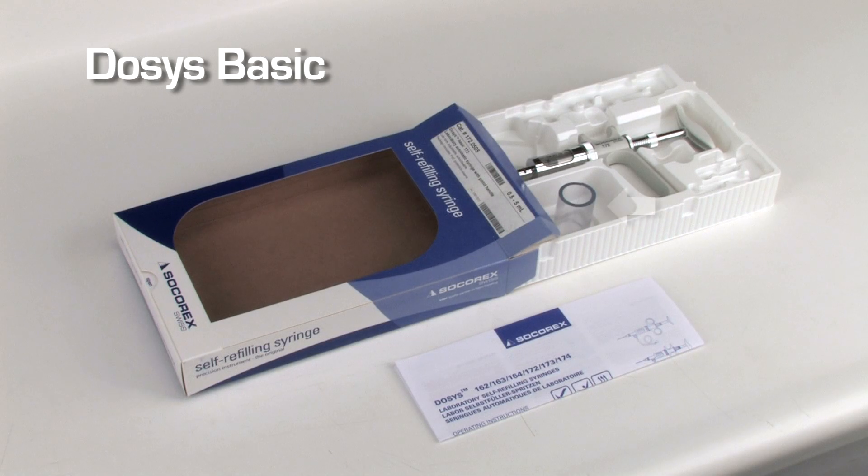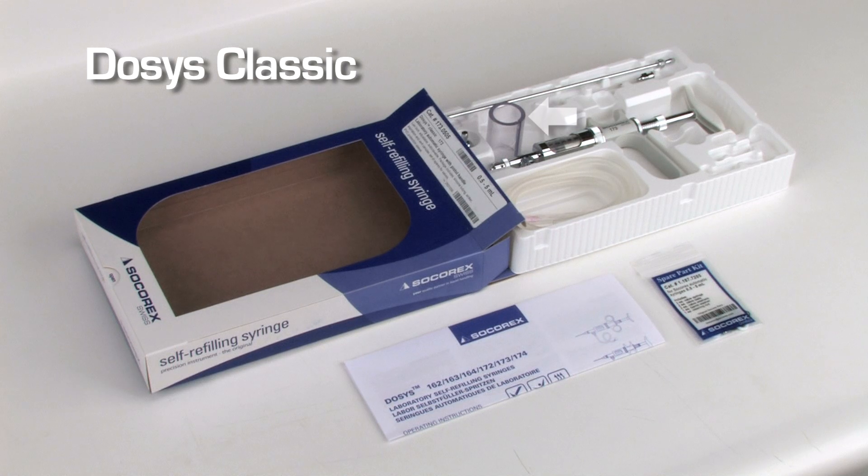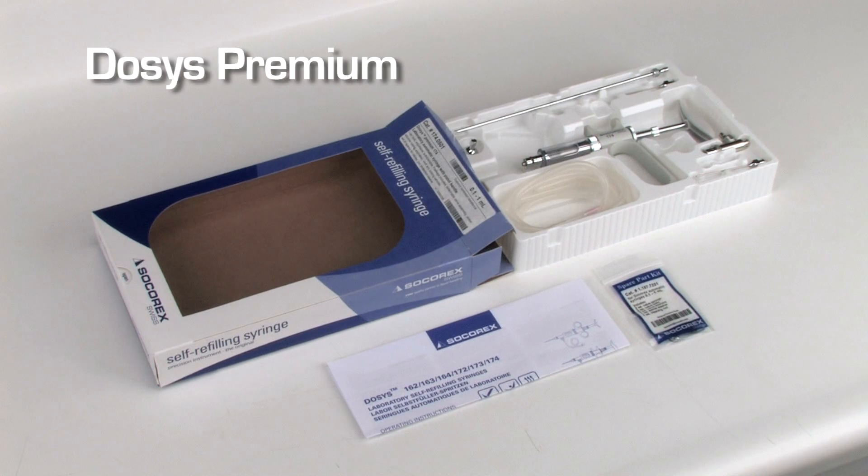The Dosus Basic is supplied with one protection sleeve and operating instructions. The Dosus Classic syringe includes a protection sleeve, feed needle, silicone tubing, sinker, set of spares for the valve, vent needle, and operating instructions. The Dosus Premium model includes additionally one valve unit and two dispensing cannulas.